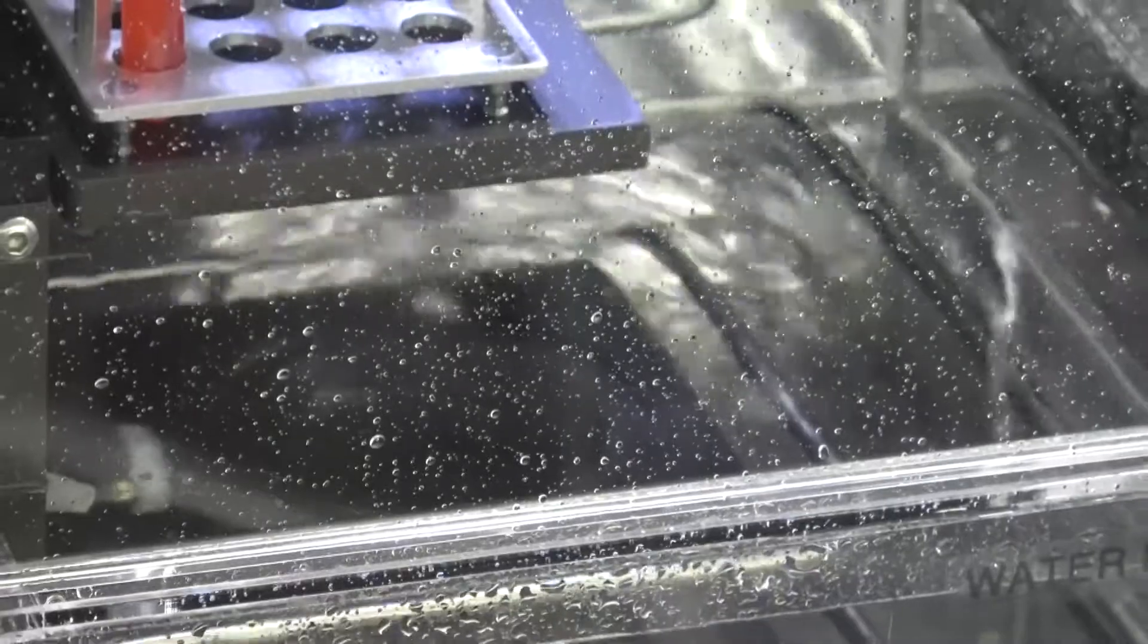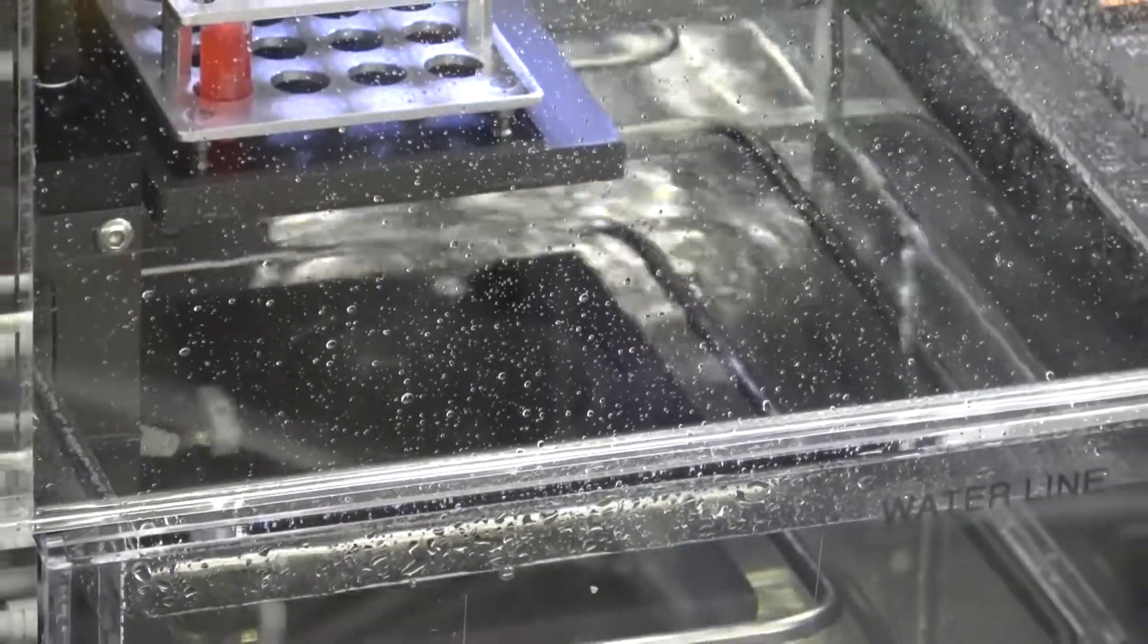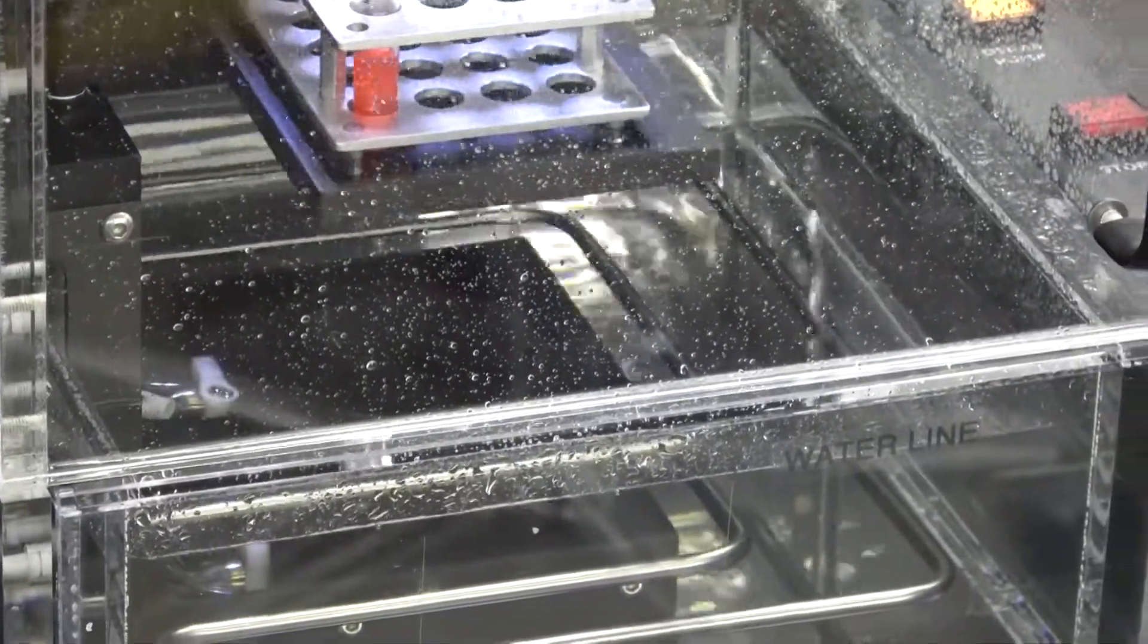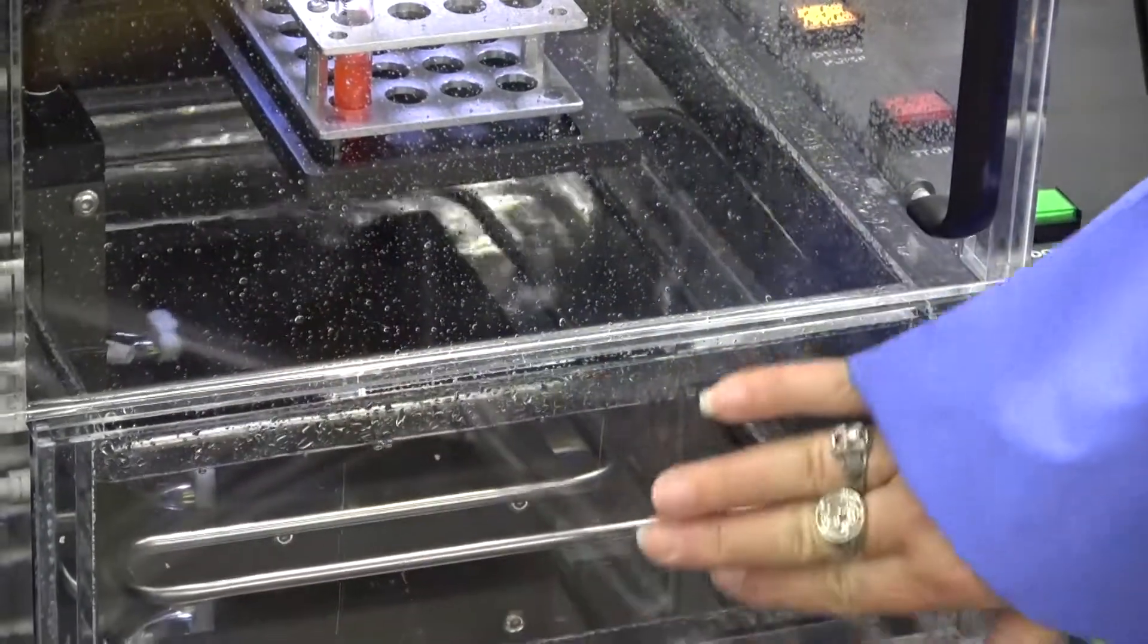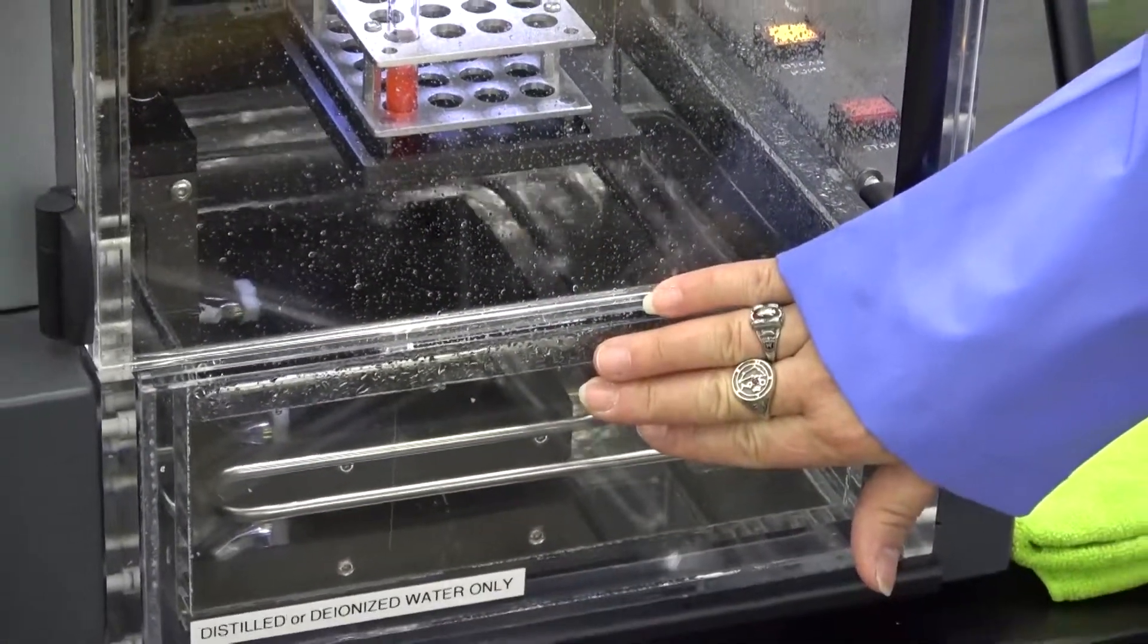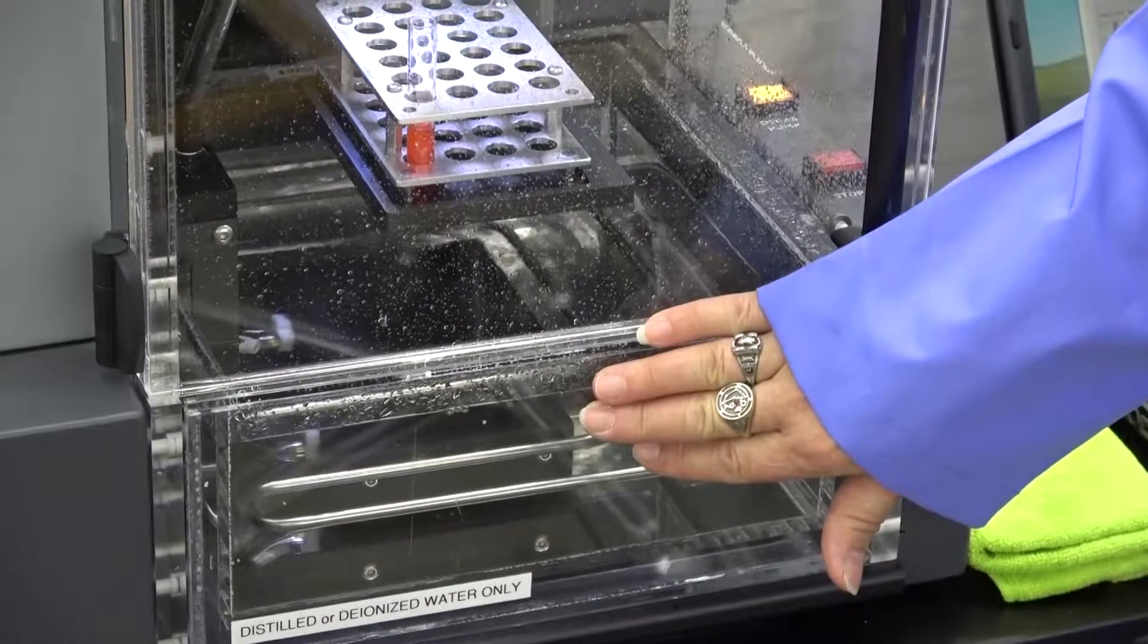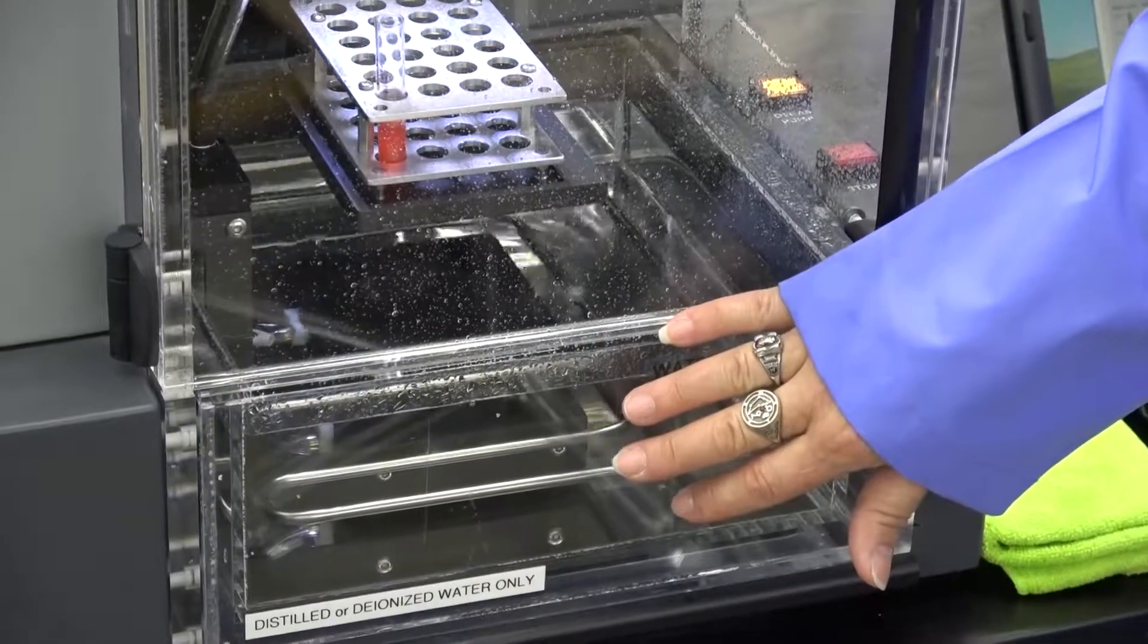The acoustic transducer down in the water looks like a little speaker head, delivers a high intensity focused computer controlled acoustic shock wave to each sample. The E-System water bath requires about 6 liters of either deionized, reverse osmosis, or distilled water.